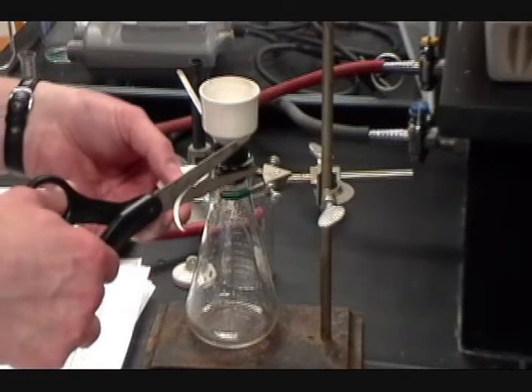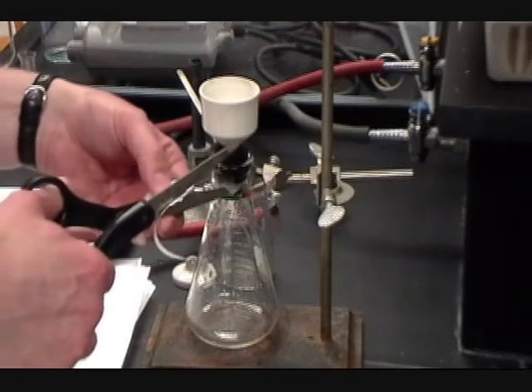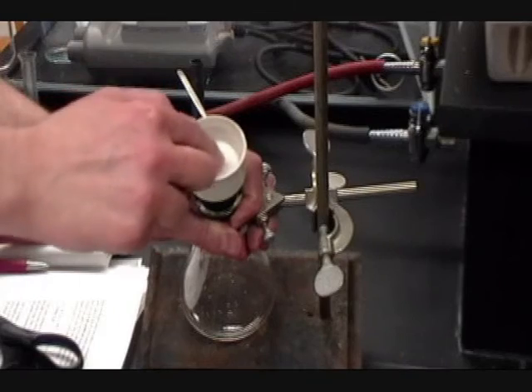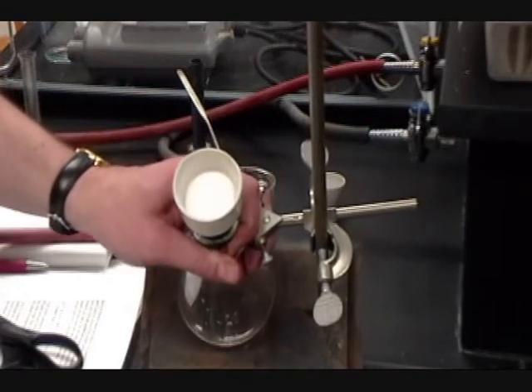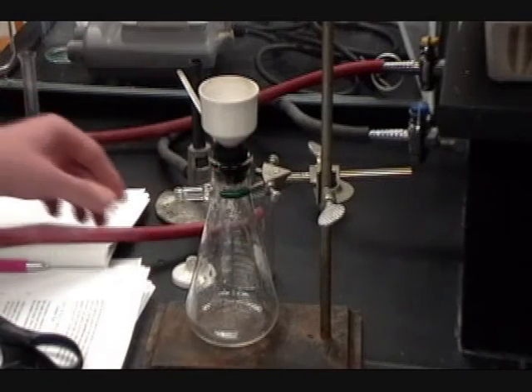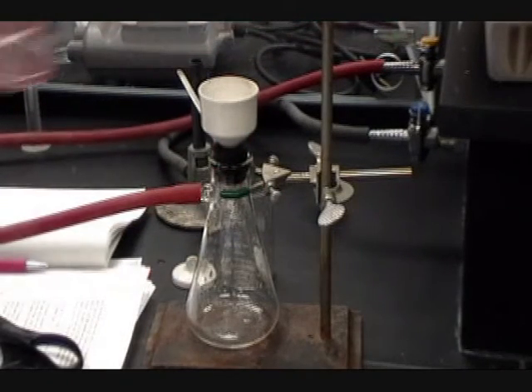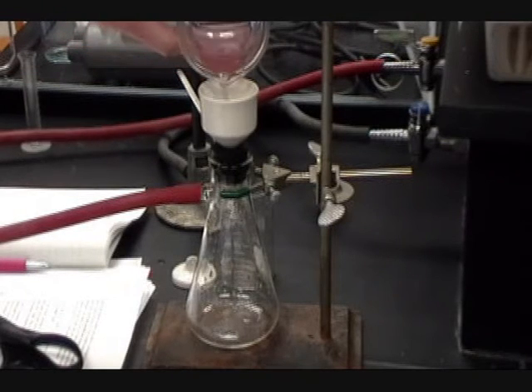Now you're going to use a Buchner funnel apparatus to filter off the copper. After it's been under vacuum for 4 or 5 minutes, add in a small amount of methanol to soak up and remove any last traces of water. Methanol is a lower boiling solvent than water, so the methanol should boil much more easily with the vacuum drying.